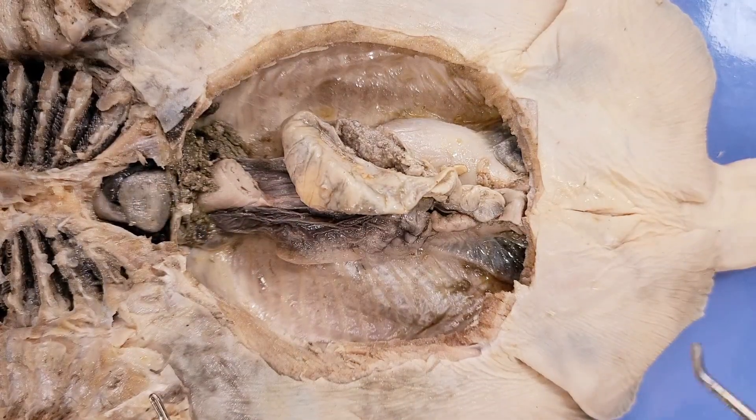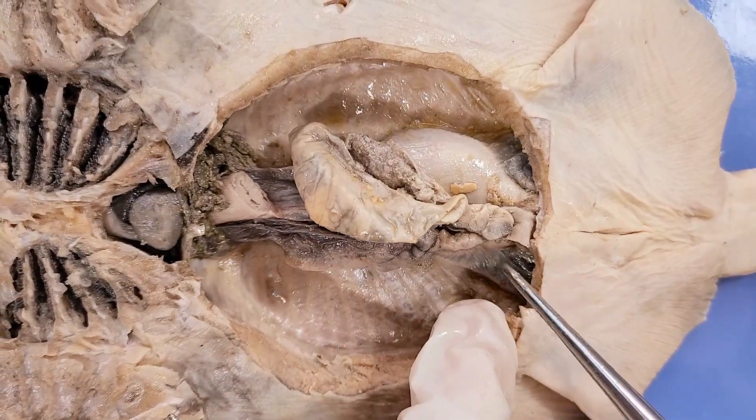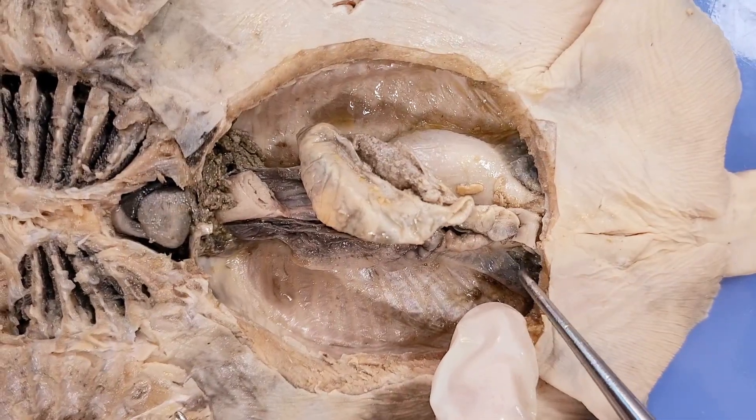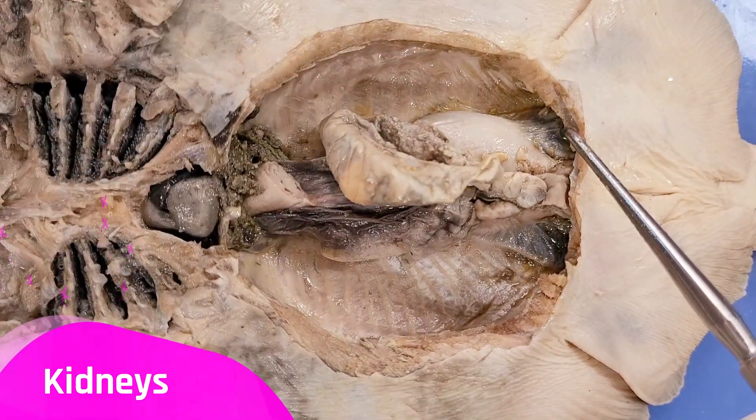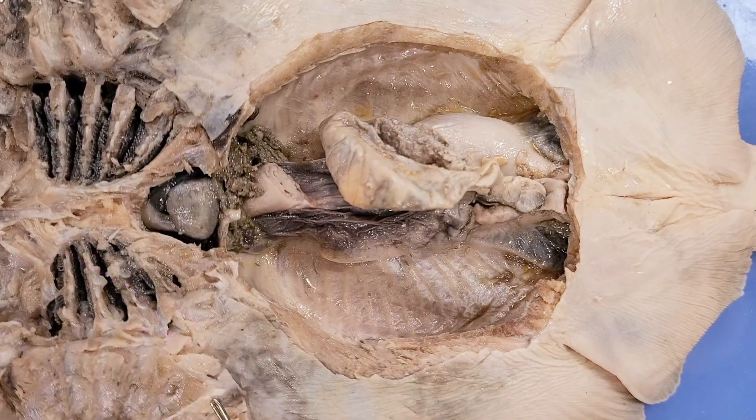Now let's look at these flat, triangular structures near the base of the tail. Here's one, and here's another. These are the kidneys, and they function in filtering blood to create urine.